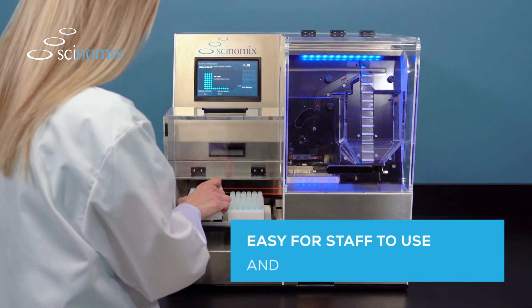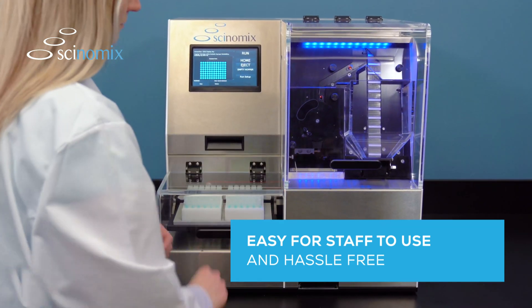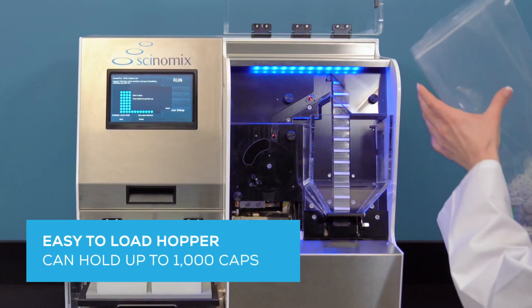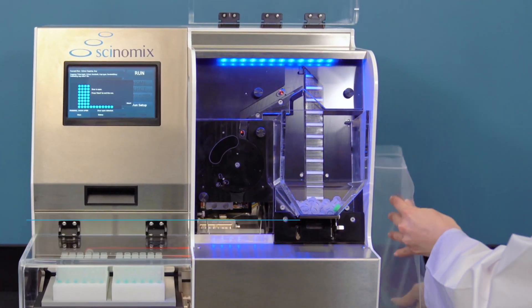Anyone can operate this system with ease, making your capping and decapping processes fast, convenient, and reliable. RapidCap2's large hopper is easy to load and generously holds up to a thousand caps at one time, reducing the need for frequent refills.